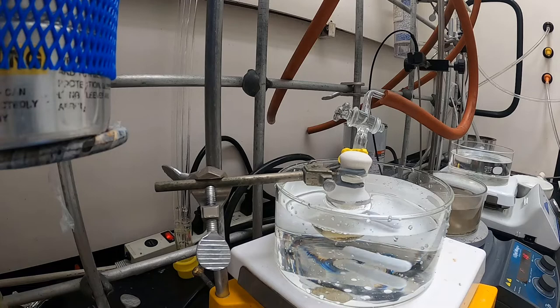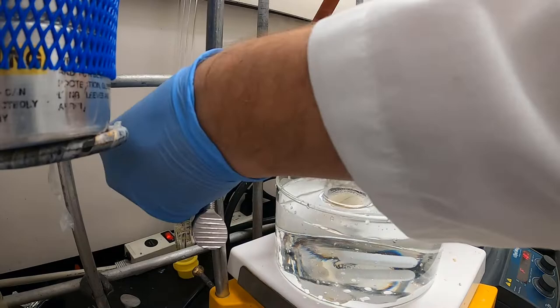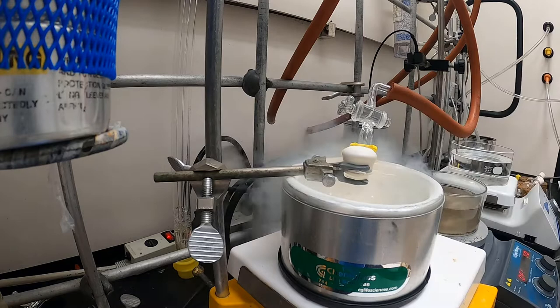The color of an ATRP reaction mixture depends on several factors, including the copper type and ligand used. In this case, a dark red-brown is typical. After the reaction mixture is fully thawed again, I will remove the flask from the water bath and then freeze it again using liquid nitrogen.